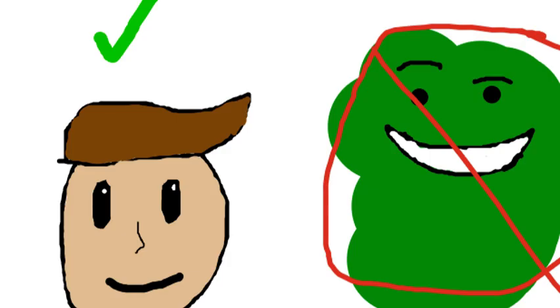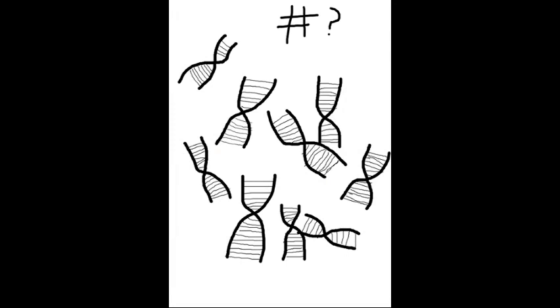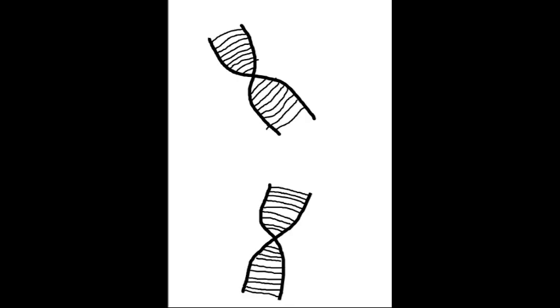Quantitation is used to determine if the sample containing DNA is human and not some bacteria or other organism. In order for the next step, amplification, to be carried out to its fullest potential, quantitation must determine the amount of DNA in the sample. This is due to the fact that amplification requires a narrow range of DNA input. There are many things that can be learned or used from quantitation. PCR, which Aiden will go more in depth on later, will be able to occur, as well as DNA profiling and quality control.